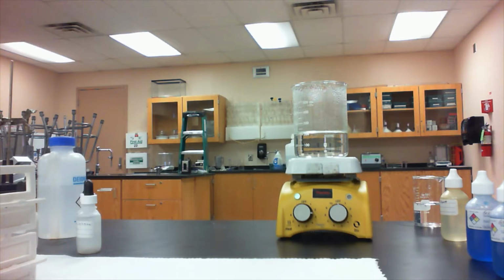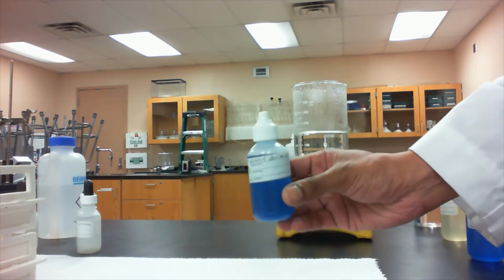So in the carbohydrates experiment, we're going to be doing 3 tests that take advantage of differences in structure of the carbohydrates, as well as differences in what functional groups are present in each carbohydrate. And remember, carbohydrate is just another word for sugar, and there are many types of sugars that we're going to encounter in this class.